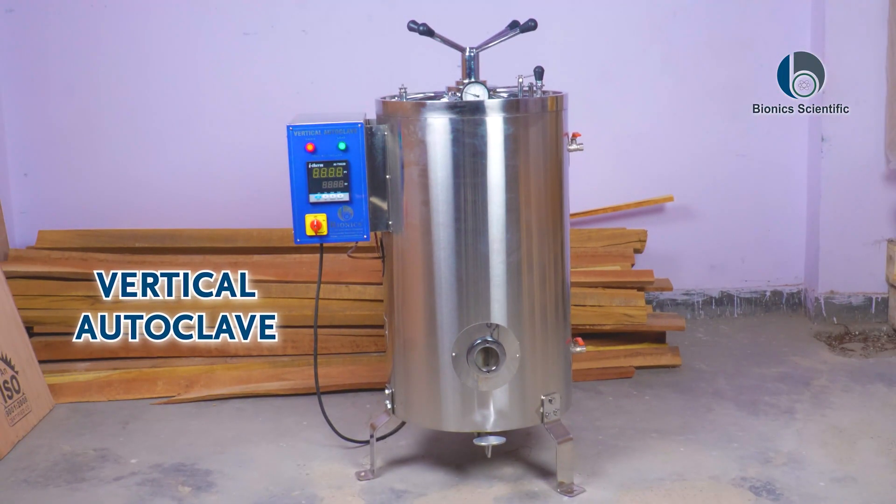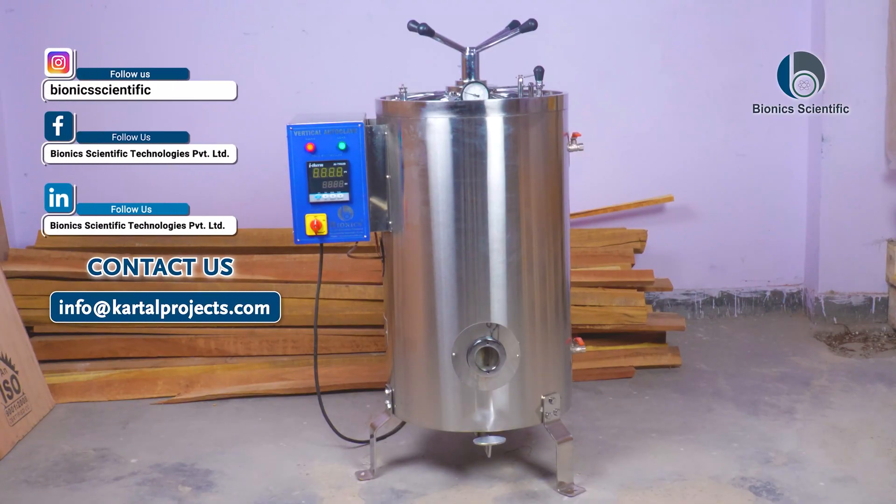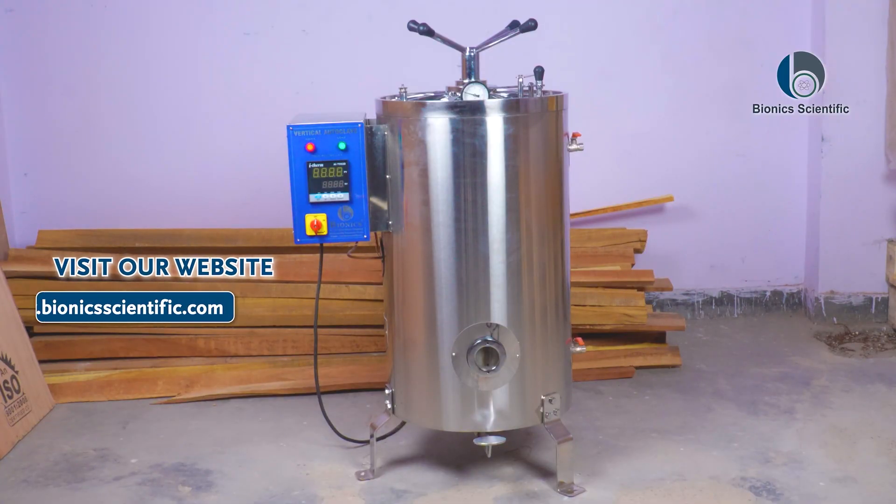This is our vertical autoclave, double wall, which is of 95 liters capacity, and we can customize it as well. If you want to buy this autoclave or any other autoclave from us, you can email us at info@kartalprojects.com or visit our website at www.bionicsscientific.com.